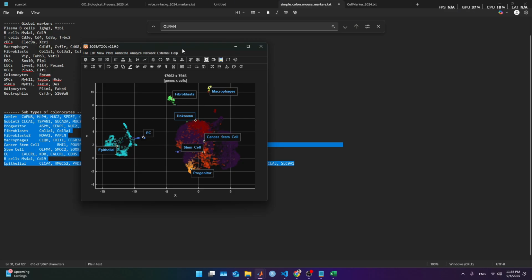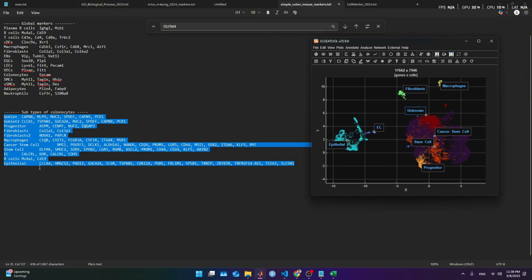That's what we got for today, and we built this atlas. It is complicated, but it is what it is.